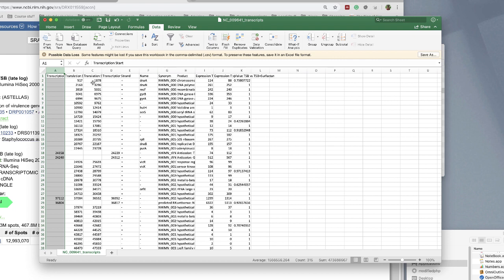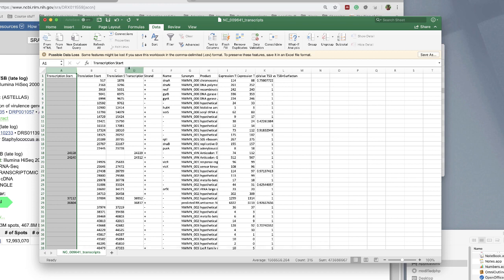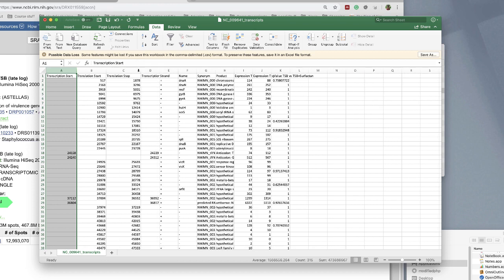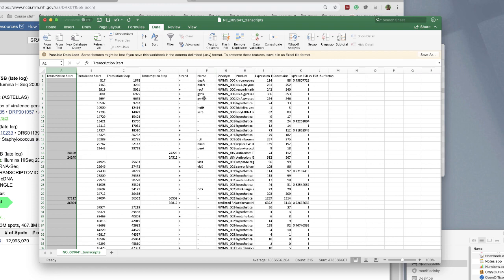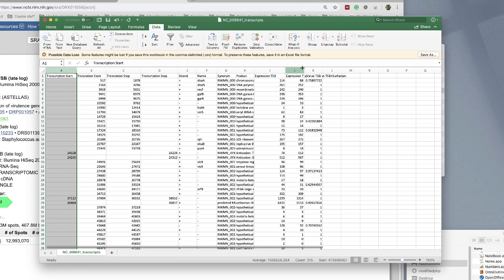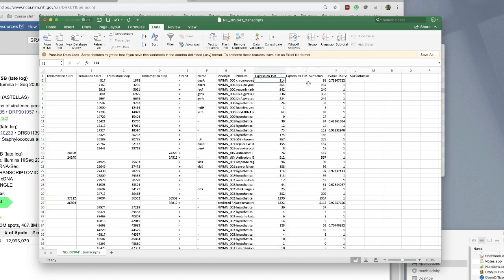Now it's all separated into a tab-delimited layout. The first heading is transcription start, the second is transcription stop, then there are translation starts and translation stops. It tells you if it's the plus strand or minus strand. Here's one column of interest: the name, which tells you the gene. And then what we're really interested in are columns I and J — this tells you the relative expression in each condition. Column I is the one in TSB and column J is the one in surfactant.